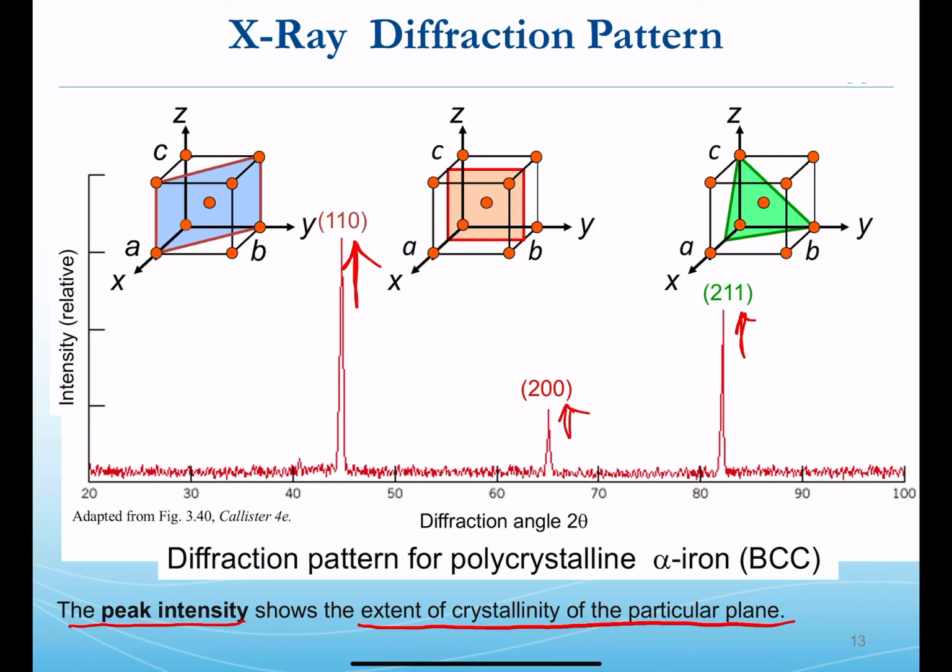So how far sets of planes, for example, if we could extend the lattice, which we know is represented by the unit cell, and we could extend this very, very far, the set of 200 planes here would be very deep into the sample, and we'd expect large intensities here. If the sample was very short, we didn't have a lot of crystallite present, that is this dimension before we go to a different orientation, a different crystal with a different orientation, or to a boundary of the material, then the intensity is going to drop.